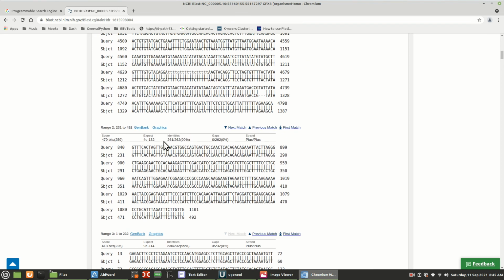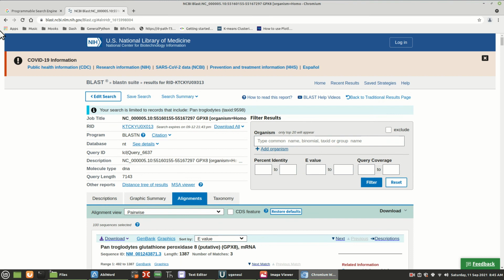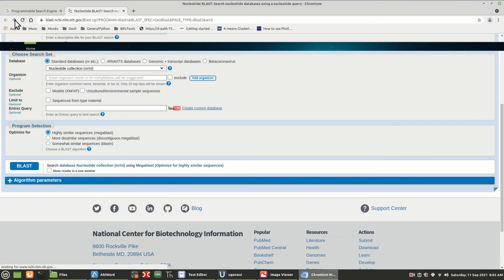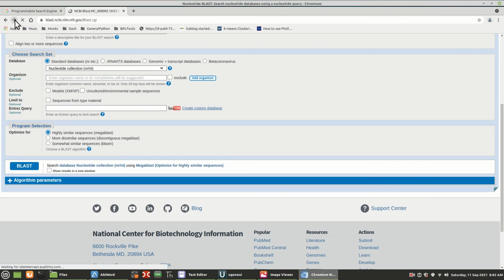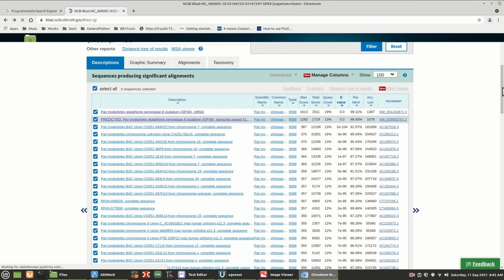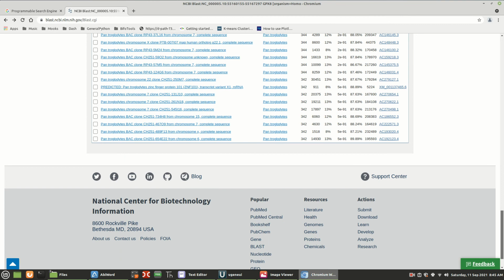Now you might get one long sequence. You might get several small ones, but just realize that when you click on this, oops, let's go back. All right, when you click on this, if you scroll down here to the bottom of all of these, no, they're not doing that anymore.